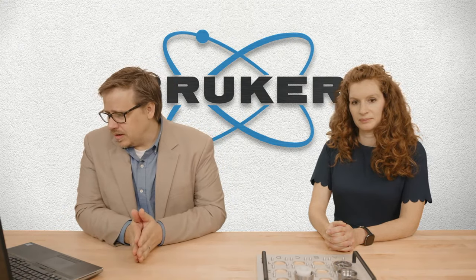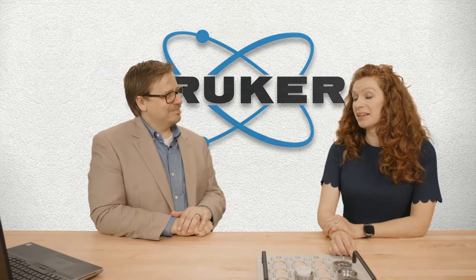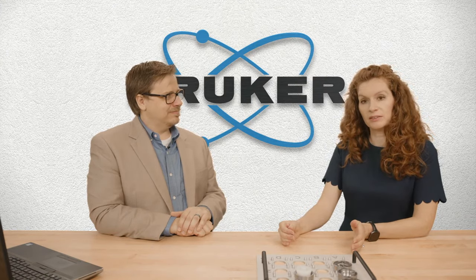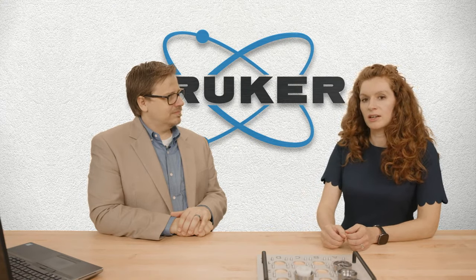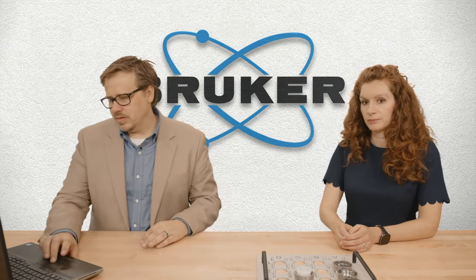All right, let's go back to our questions here from Satish Kumar. I calibrated with an 8-gram sample and a 2-gram binder. Does using a 10-gram sample and 2-gram binder make a difference in the results? Yes. If you use 20% binder and that's how you calibrate, and then you reduce your amount of binder, your intensities will be higher, right? So if you don't tell that to the software, it will give you wrong results. However, you might be able to set up your application in the end to accommodate different amounts of binder and sample. Okay, there we go.